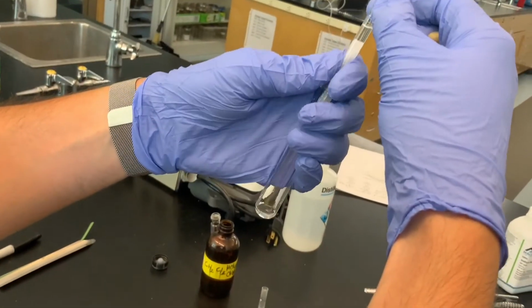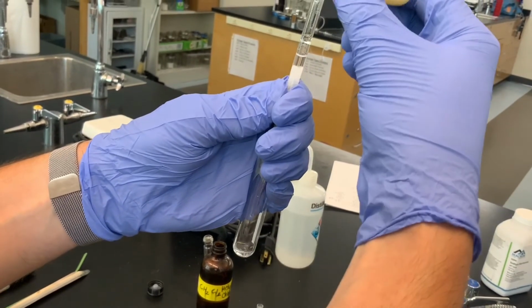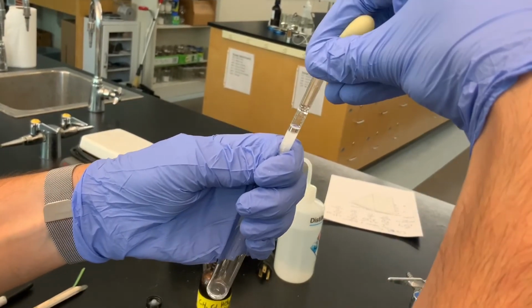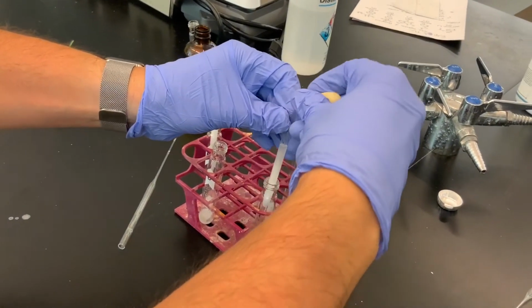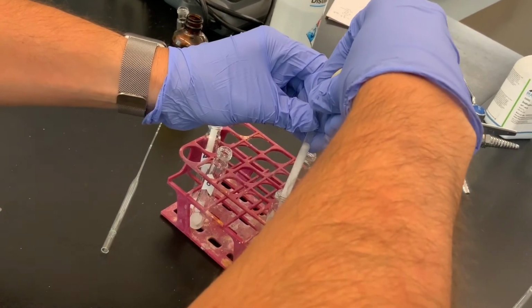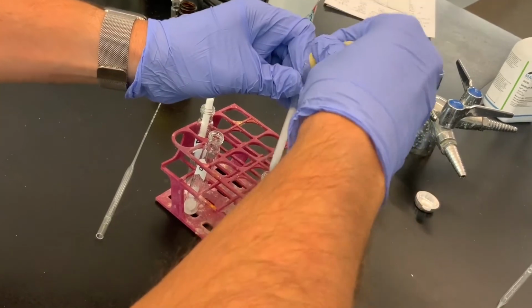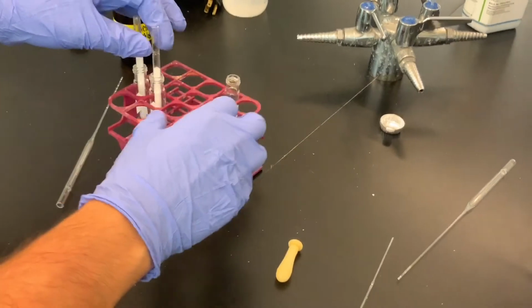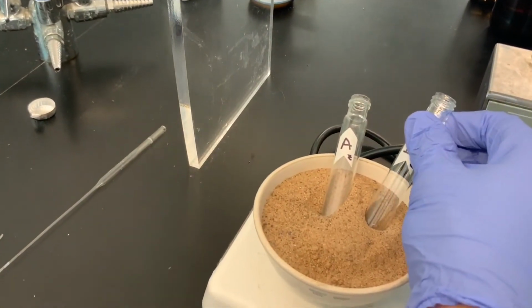And once again, we're going to see that it's coming down, but I'm not going to wait for gravity, so I'm just going to gently place the pipette bulb at the top here. I'm going to let it down though, and force air down into it. Okay, so part B is complete, and now we're going to evaporate off that methylene chloride as well.